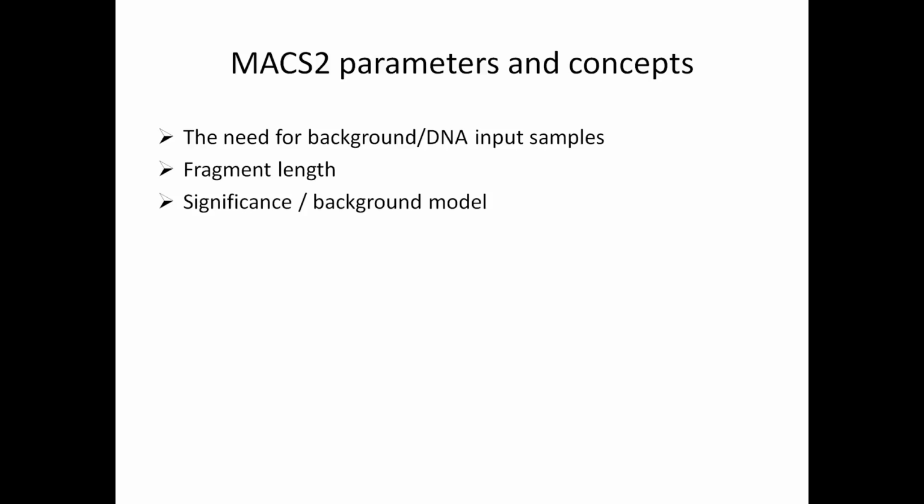The background model comes from a number of different aspects of the genome. Firstly, the input reads in the candidate binding region, that coverage is also determined, and that's one facet of the background model. The coverage over the entire genome background is also calculated.